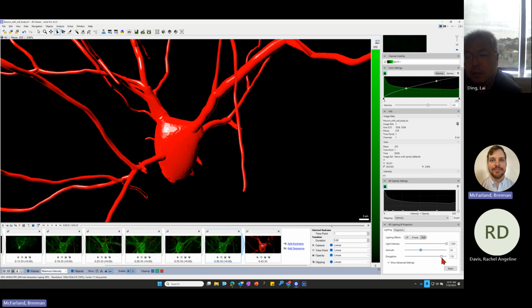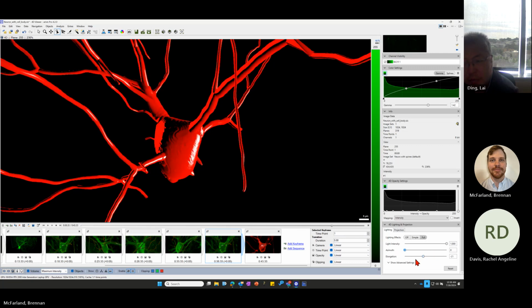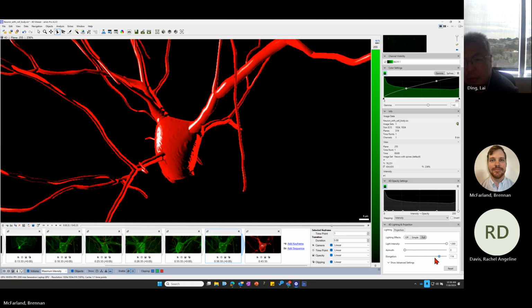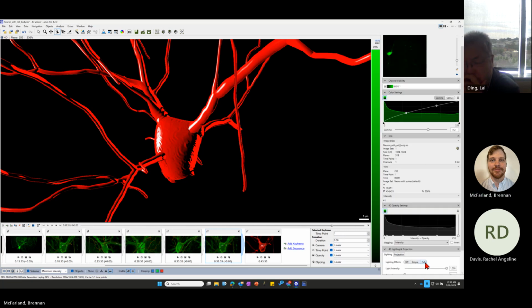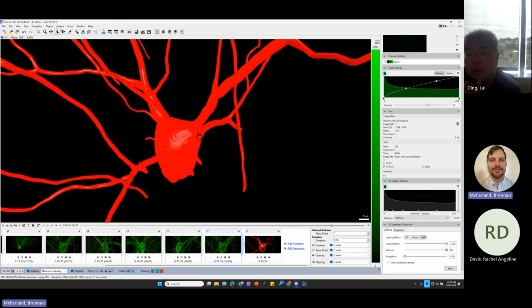And then what's called elongation. So a lot of lighting options there. This can be useful if you want to emphasize certain regions, depending on your view. Like if you want to emphasize maybe the front part of this and ignore some of the back regions, or you can just turn it off and keep everything pretty consistent, and kind of like one tone throughout it all.